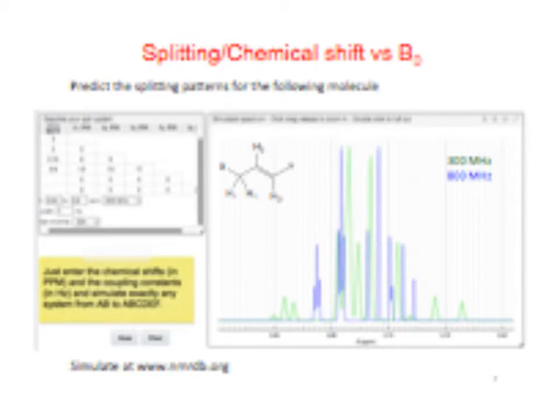And what I've done, it's hard to see the green ones, is in this program, which is just simulating couplings. I cut part of this off, this is like 1, 2, 3, 4. I just took those ones out, so I just have 4 protons in here.